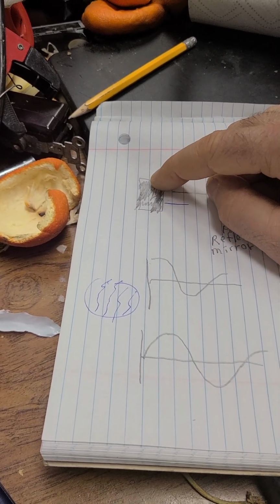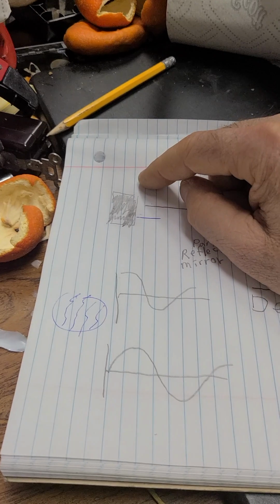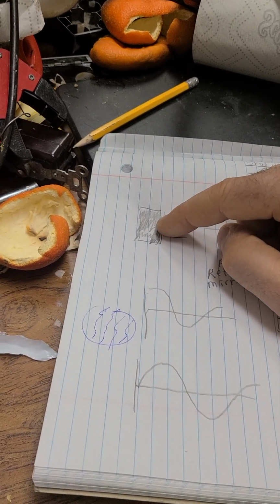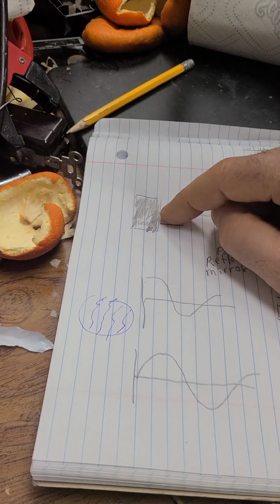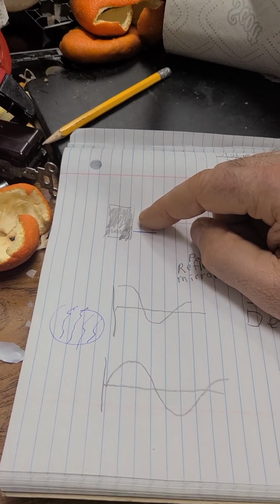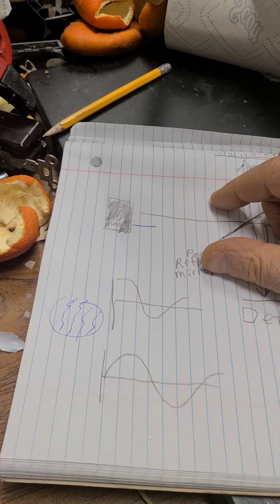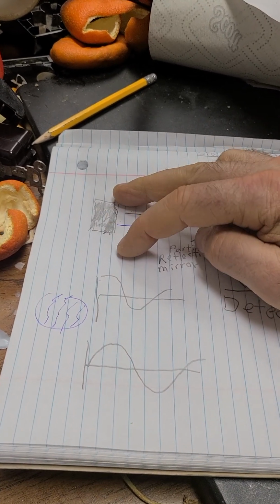In other words, a particular molecule is bumped rapidly, and it would emit a more rapid frequency of infrared radiation. The deal is, if you go to a different spot, a bunch of different molecules are bouncing around randomly, and since they're bouncing differently, if I did have a super powered oscilloscope with an electromagnetic detector, which we do not have, and we actually could graph the electromagnetic radiation coming off, it would be a different graph from two different spots.